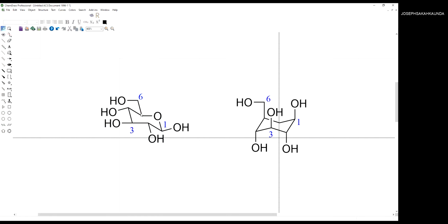This one comes around 77. Usually 5 and 3 are always the largest ones. Sometimes 3 could be larger than 5. Sometimes 5 is larger than 3. Yes. And then, let me say, 5 is largest, followed by this guy here, number 3, followed by this, and that is the smallest in this.